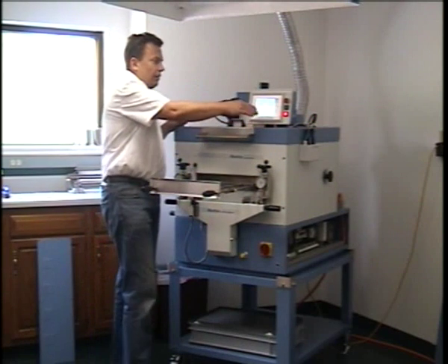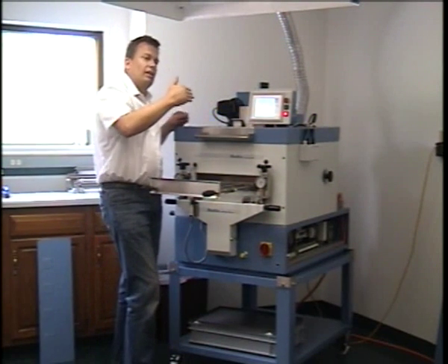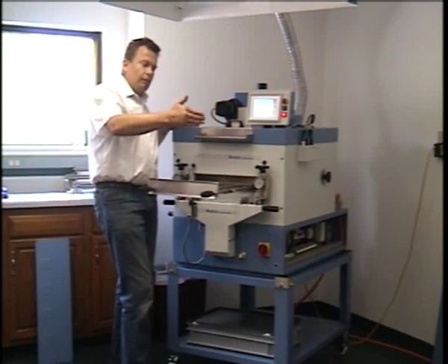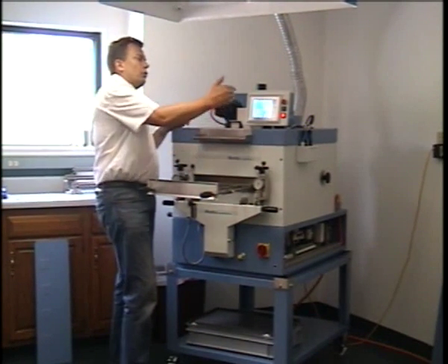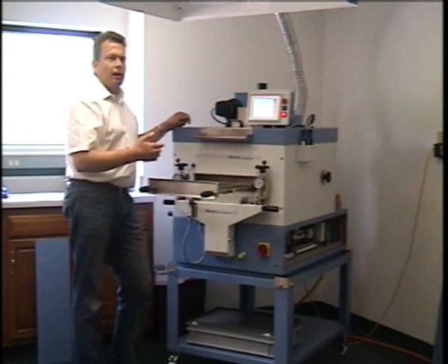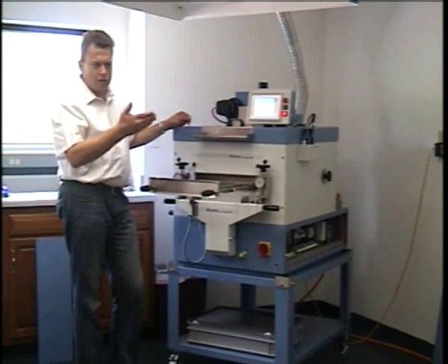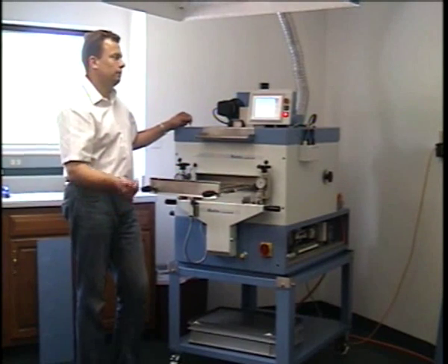Now if you take the example with mode B, if you have a 30-second dwell time, the dwell time will start immediately, but the trigger temperature will start a second timer to tell you how long your sample was exposed to a certain temperature or higher.